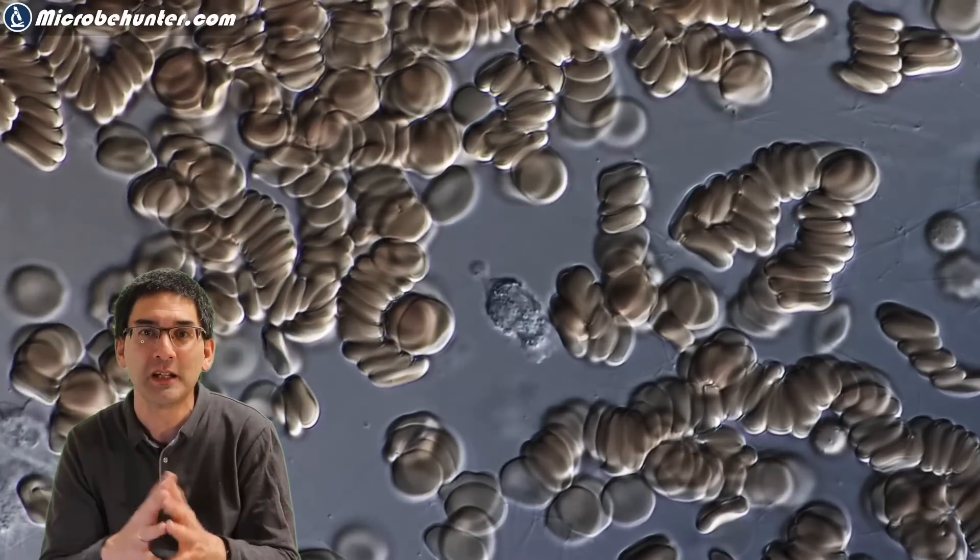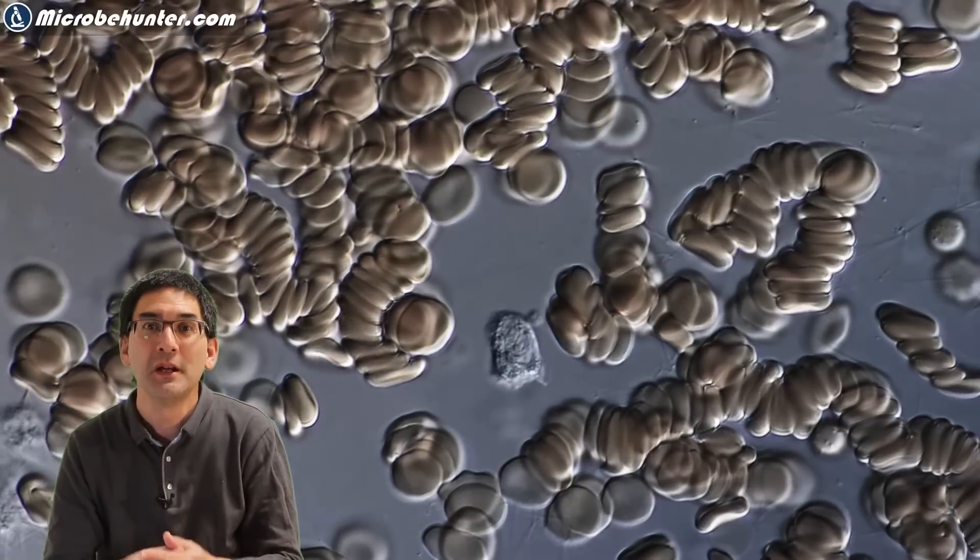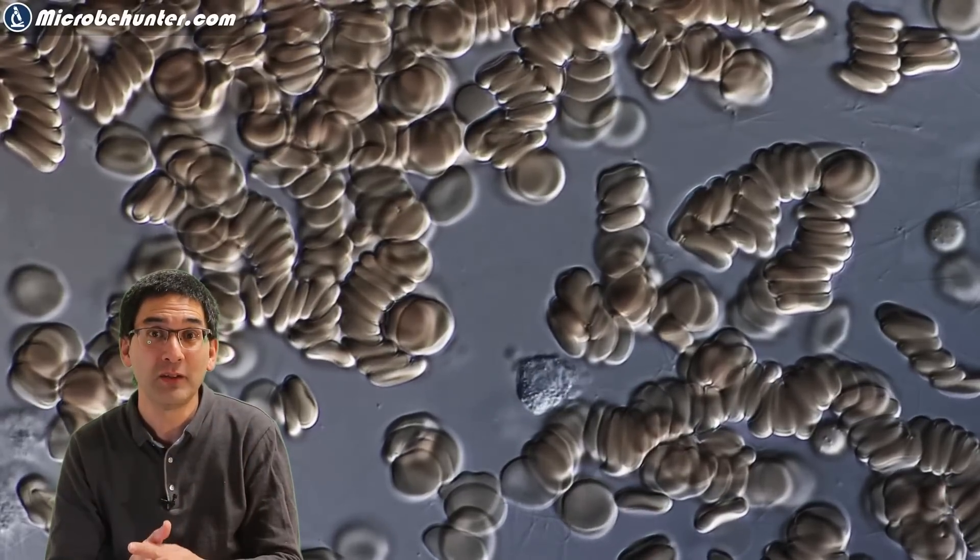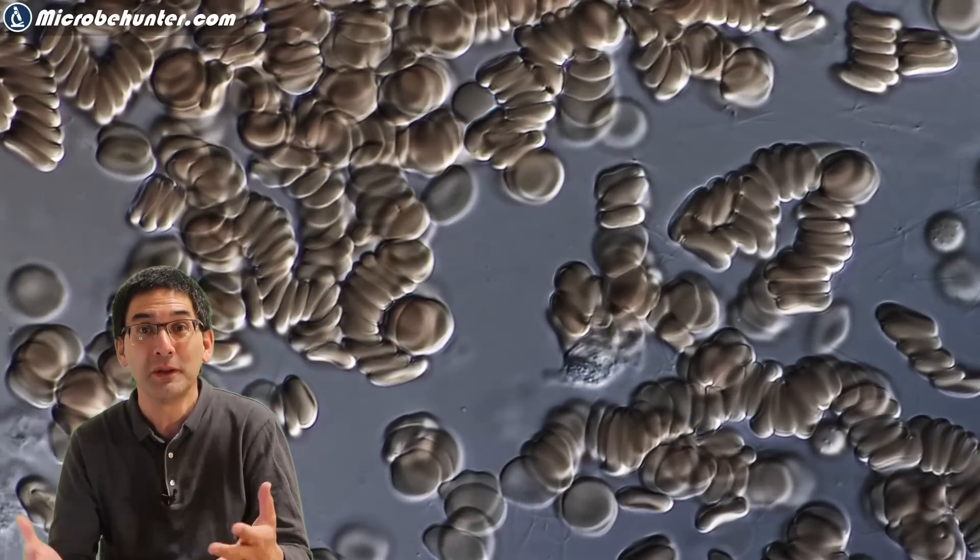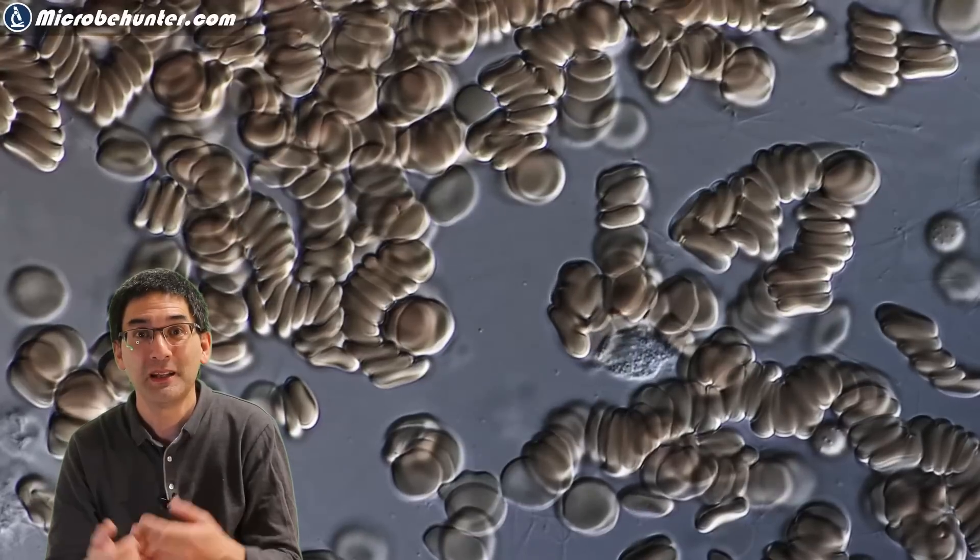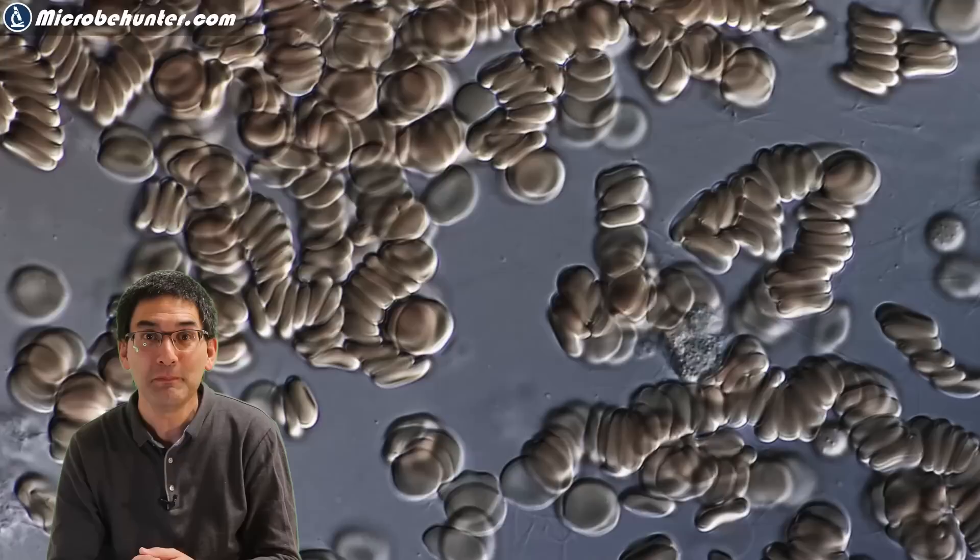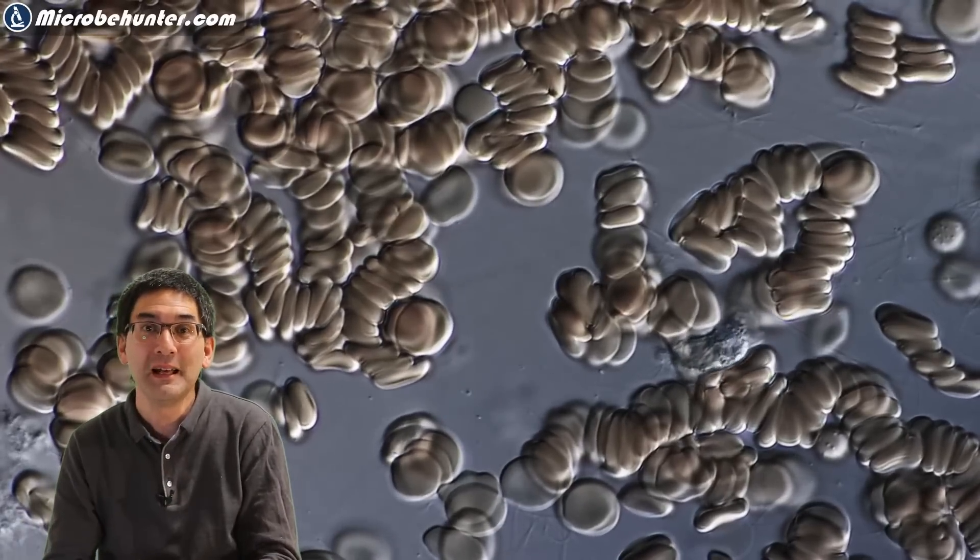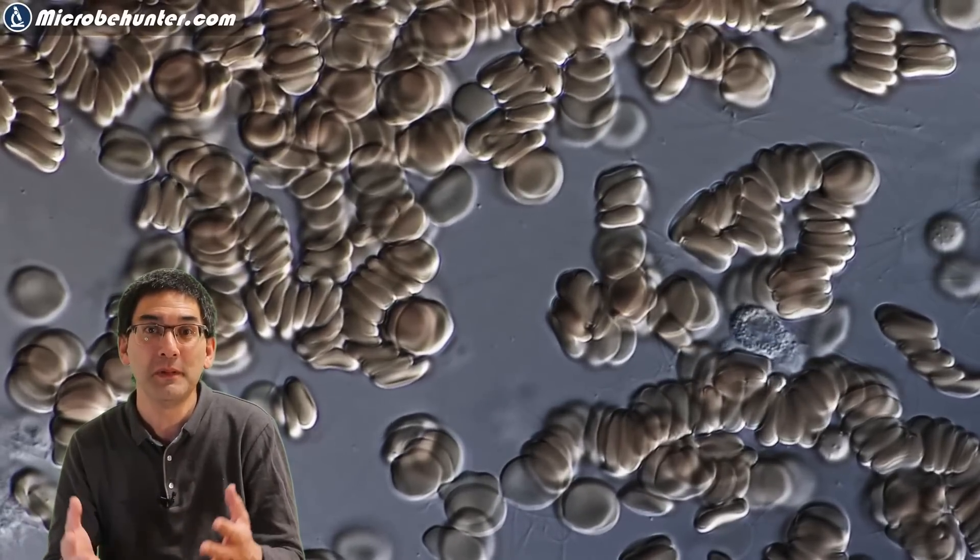Essentially, those phagocytes are only one part of our immune system. They belong to the so-called cellular immunity. There's also something called humoral immunity.